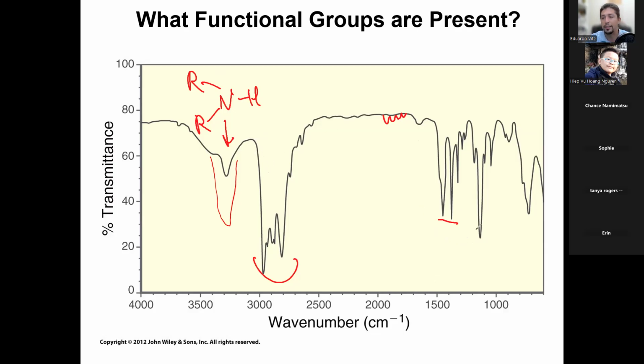Yeah, they are medium peaks. But honestly, we would need more information about the molecule. It is possible these are carbon-carbon double bonds. I suspected that earlier as well myself. But like I mentioned, without more information, it's impossible to tell. The only for-sure thing we can tell from this spectrum is that we have an NH bond somewhere. You're still thinking correctly. It is possible that's a carbon-carbon double bond. We need more information. That's really it. Any more questions about this one?